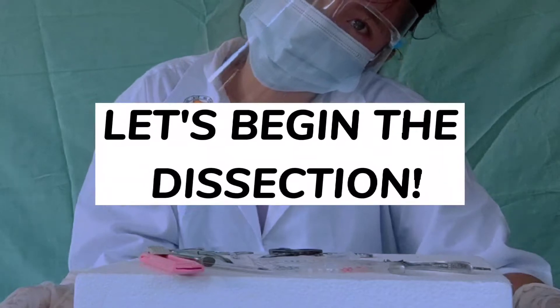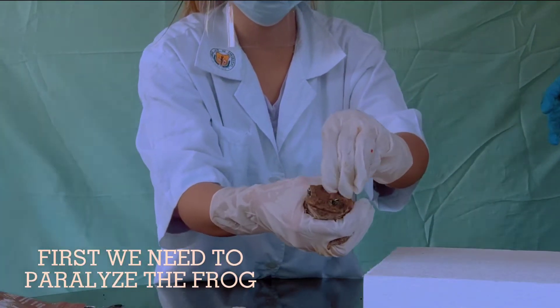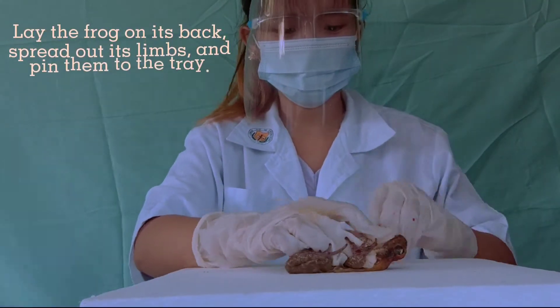And now, let's begin the dissection. First, we need to paralyze the frog. Lay the frog on its back, spread out its limbs and pin them down.